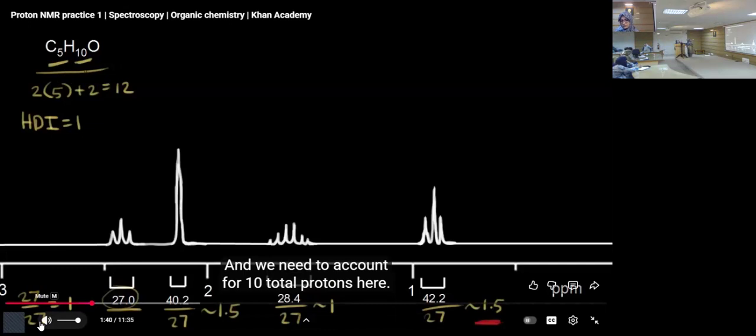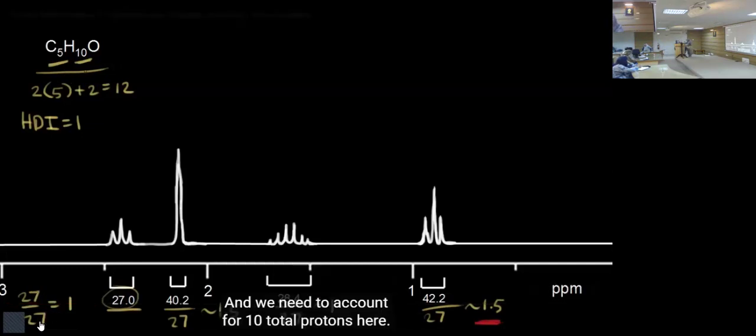Nowadays, when you run an NMR spectrum, we mostly work with the processed spectrum, and with this processed spectrum we usually do not have such fractional numbers. We have to select one.